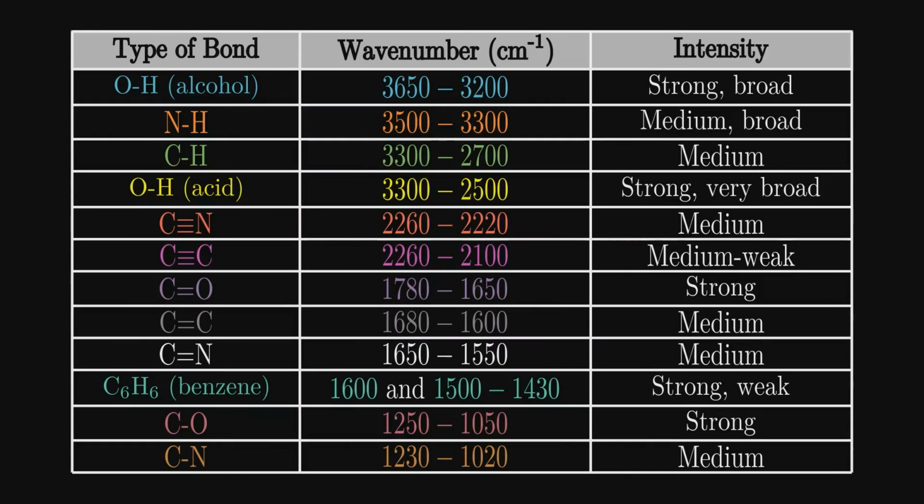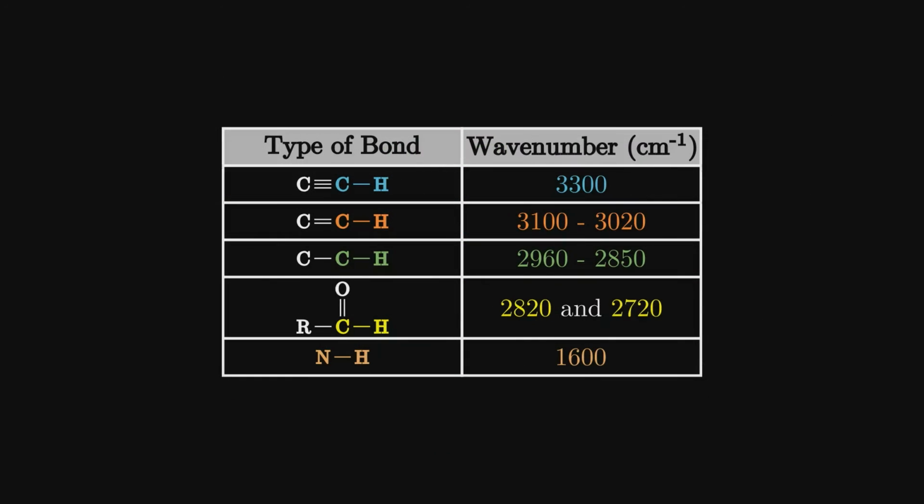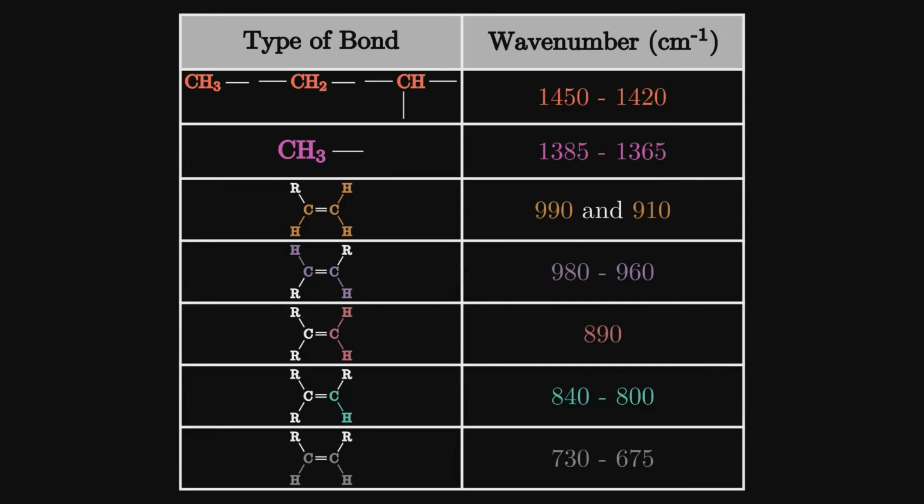Speaking of previous videos, here are the references to specific bond types and the frequency of the peaks that represent the stretch or bend. I did add the NH bend as well.